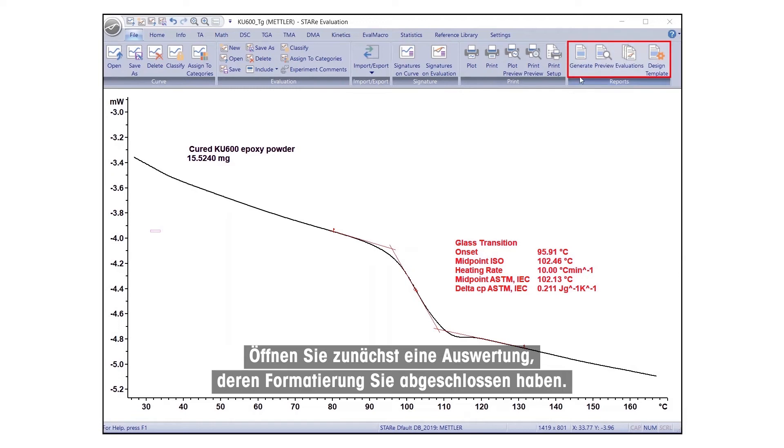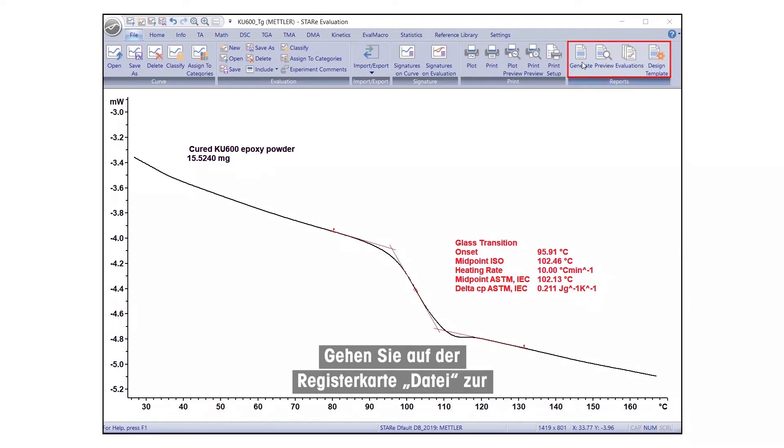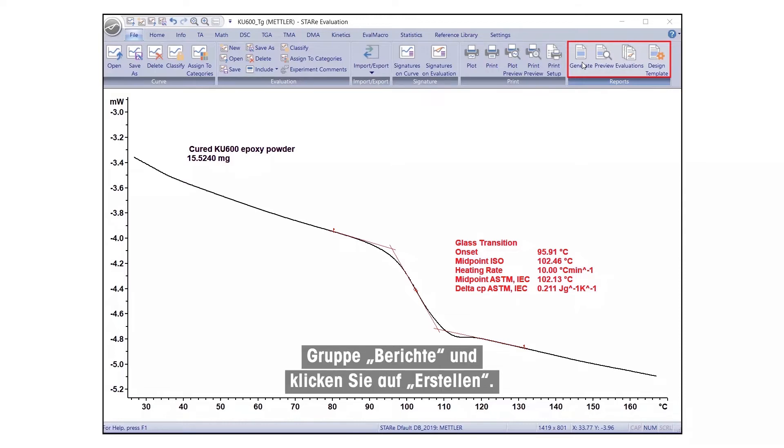Begin by opening an evaluation you have finished formatting. Under the File tab, go to the Reports group and click on Generate.